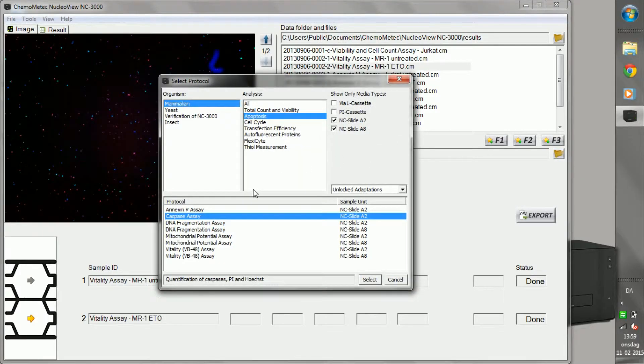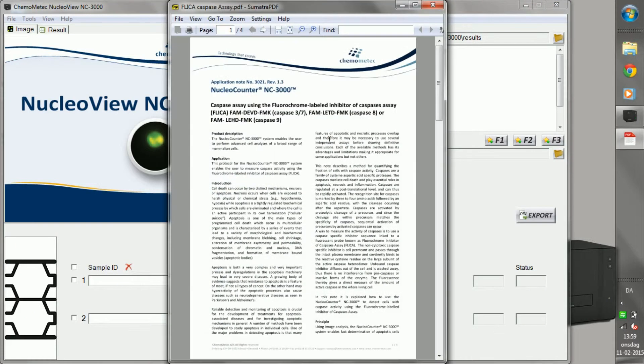For cell cycle and apoptosis assays, simply follow the directions in the protocol, available directly from the software.